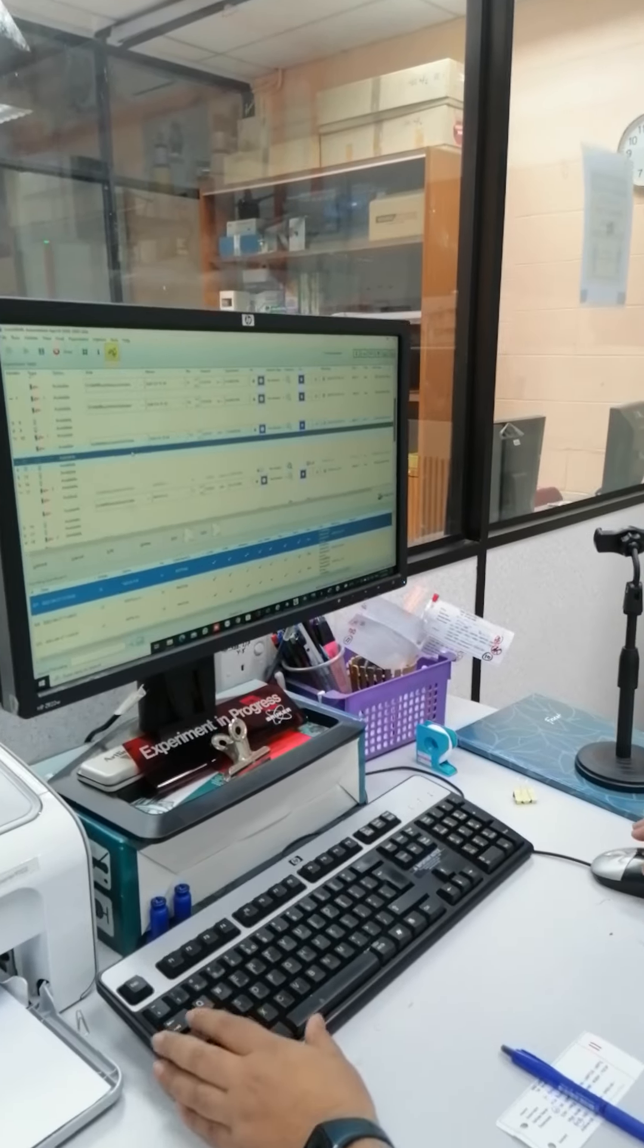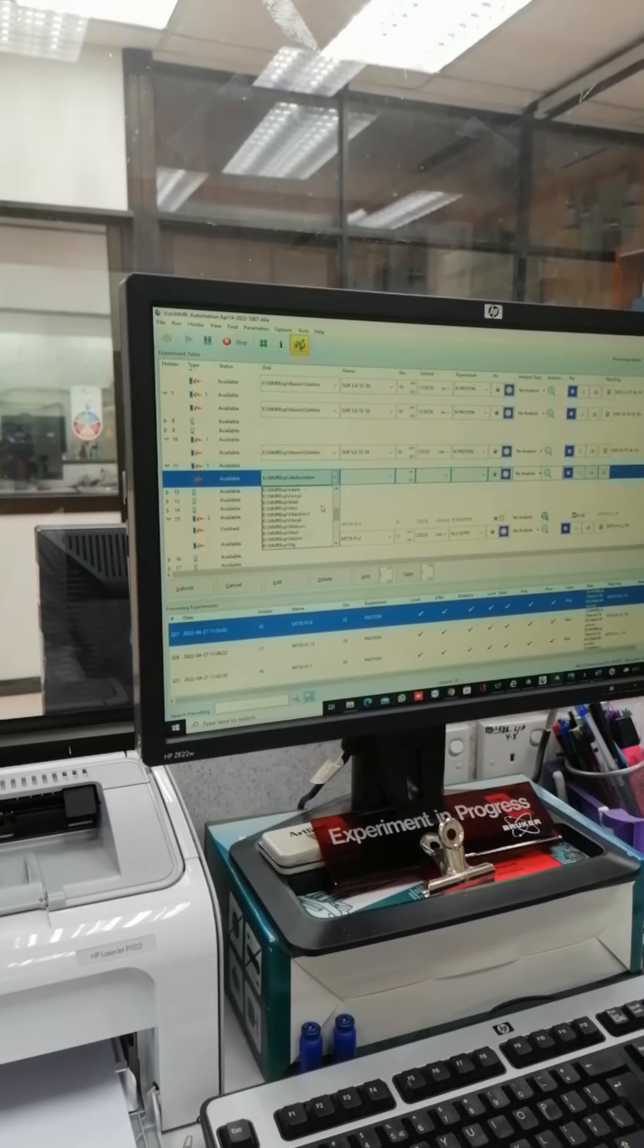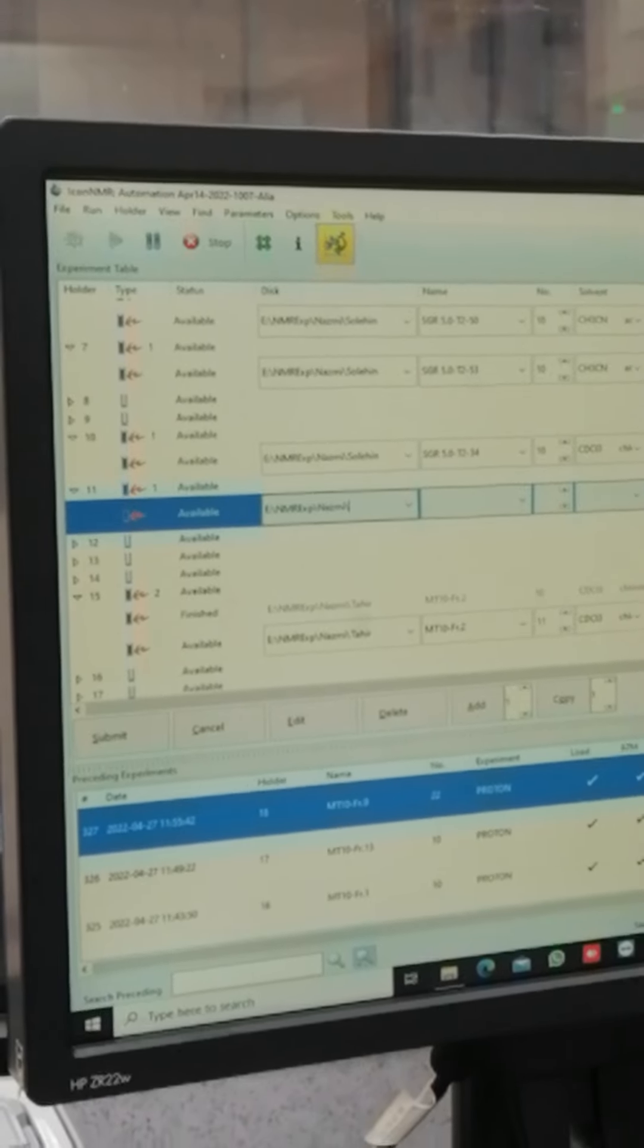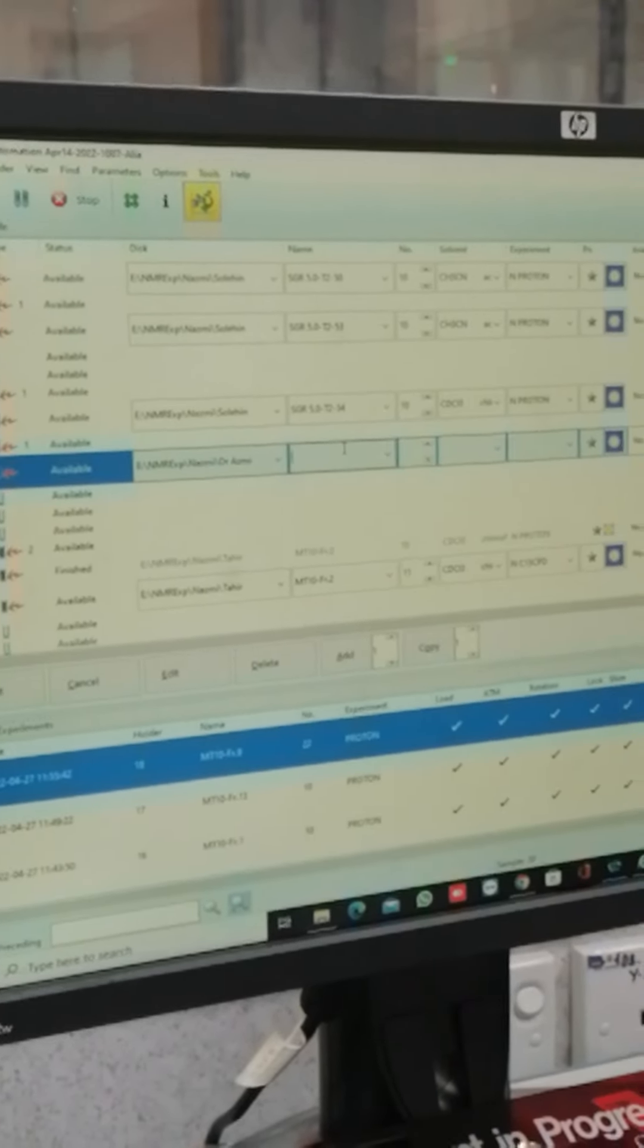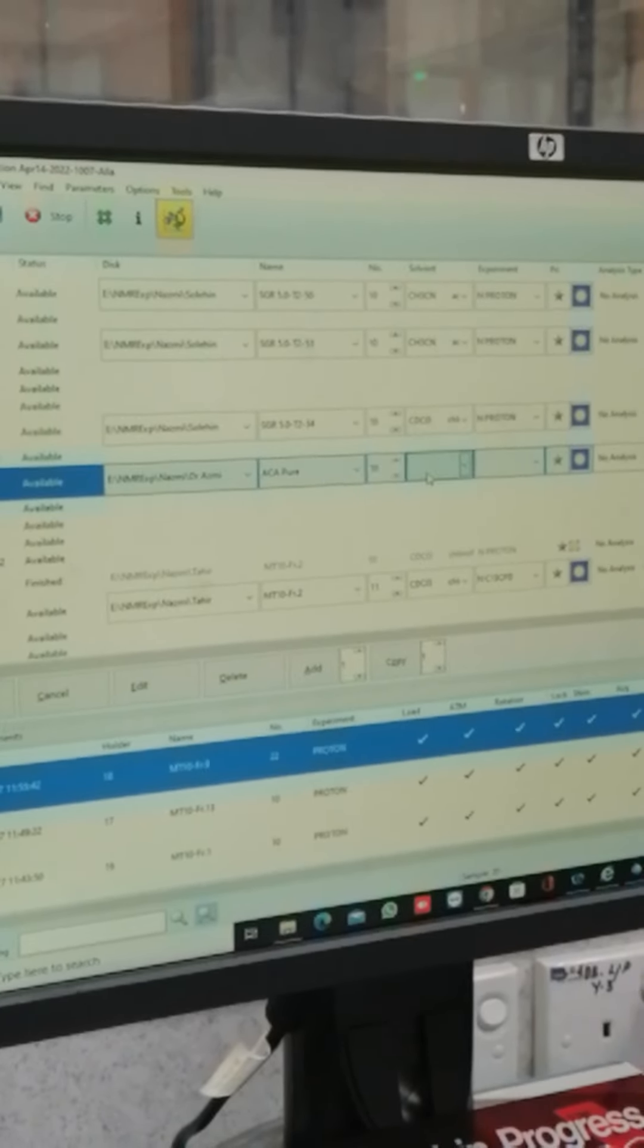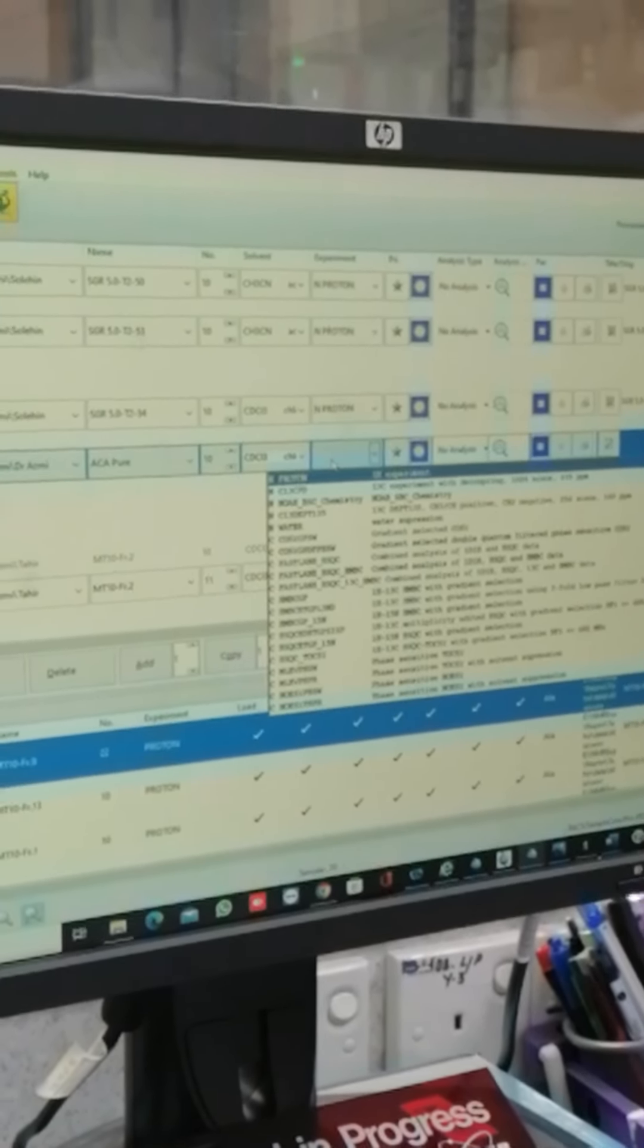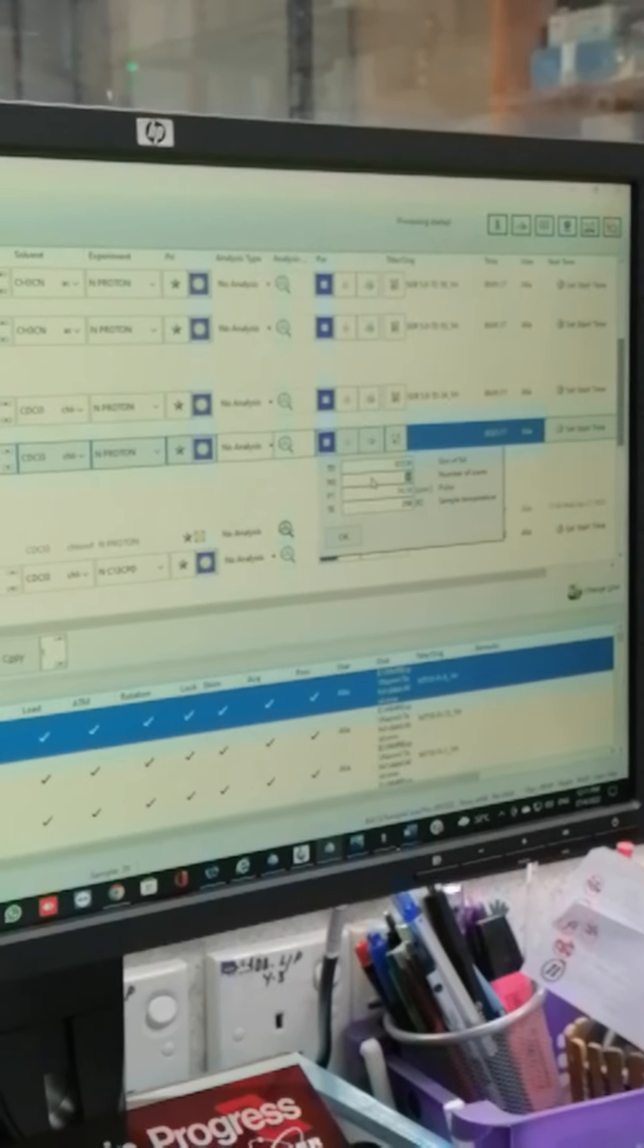We key in our sample profile in this Topspin software. Key in your respective folder, key in your sample ID. Select the solvent that you use. In this case, we are using chloroform D. Select the experiment that we want to proceed. We proceed with proton NMR.